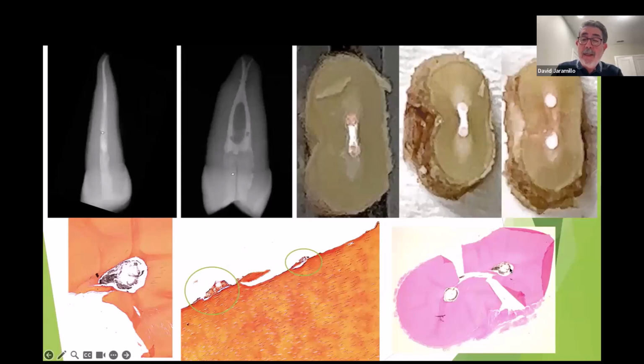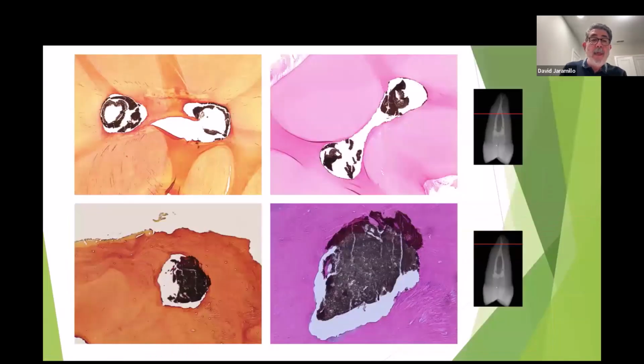So this is the crack, but inside the root canal is very clean. This black material that you see here is the sealer. Here we go to the mid portion, bacteria within dentinal tubules, but no remnants of pulp tissue left behind, only sealer in this isthmus area.